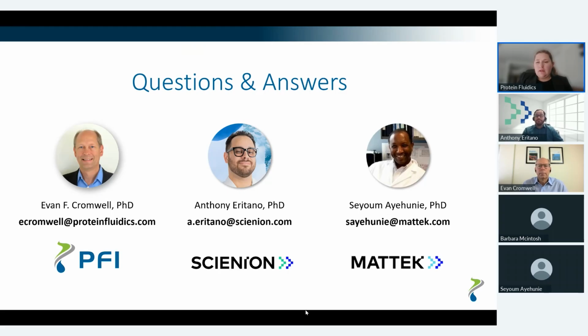Cool. And then next one is for Seyoum. What is the advantage of using patient-derived tumoroids compared to existing cell lines or spheroids?